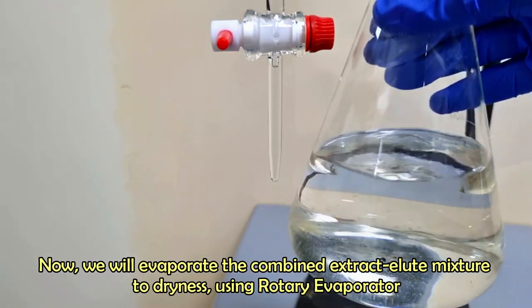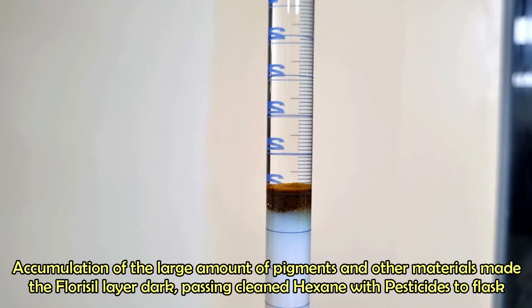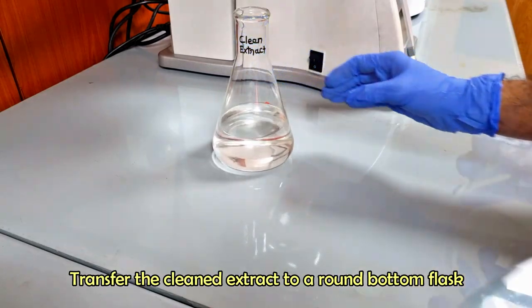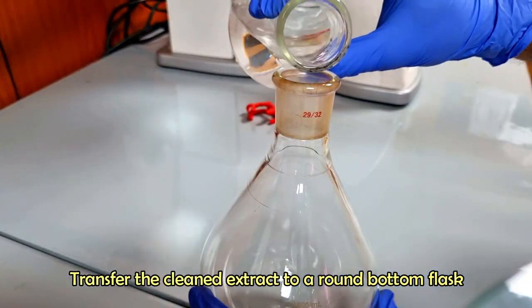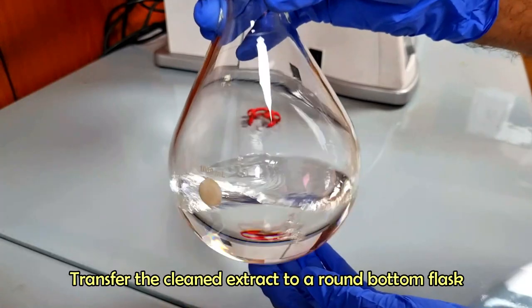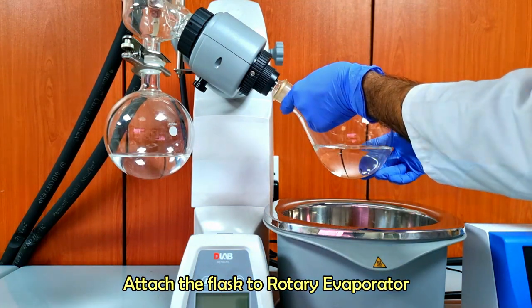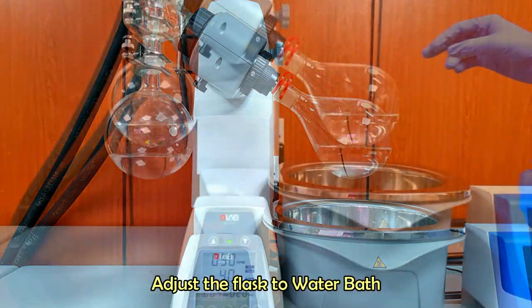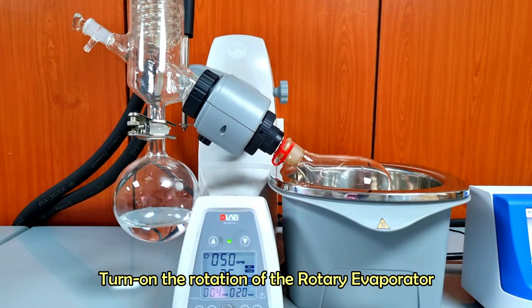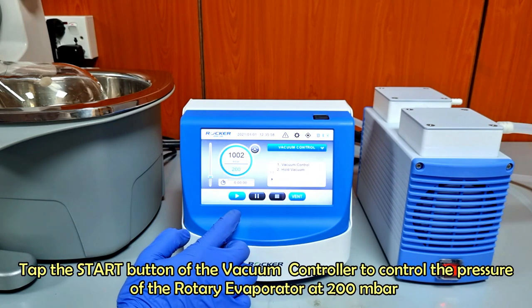Evaporate the combined extract eluate mixture to dryness using a rotary evaporator. Transfer the cleaned extract to a round bottom flask. Attach the flask to the rotary evaporator. Turn on the rotary evaporator unit. Turn on the pump. Set the pressure at the proper point. In this case, 200 millibar is enough.